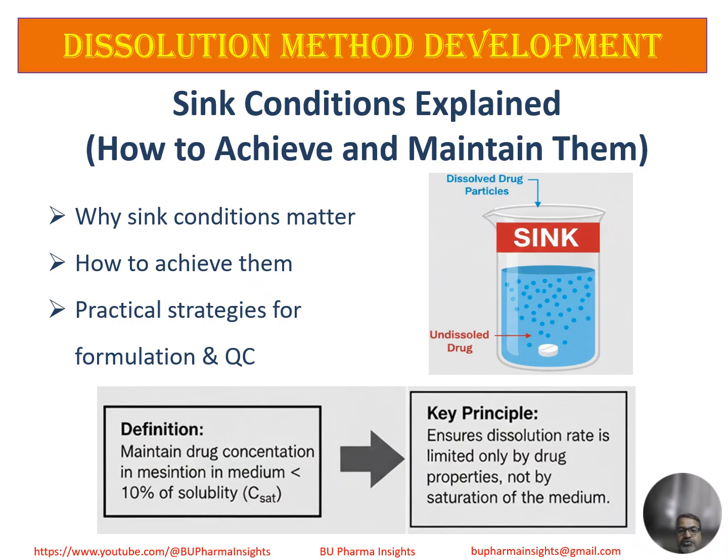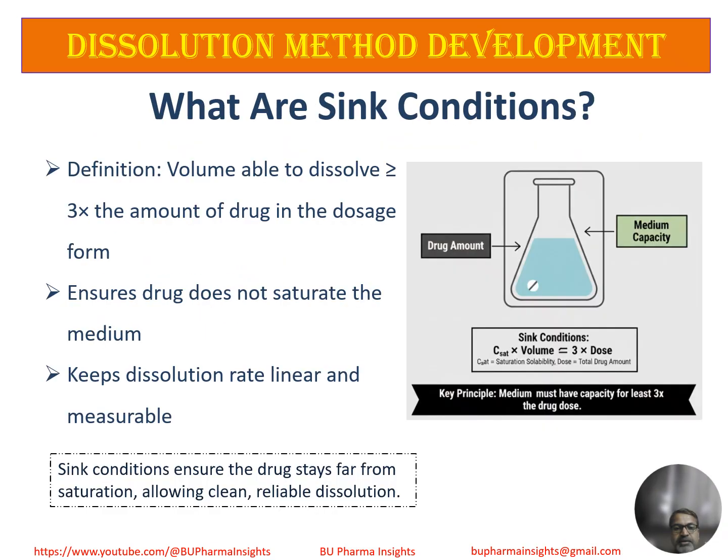Let's break down sink conditions, what they mean, why they matter, and how to consistently maintain them in dissolution testing. In this video, we will cover why sink conditions are critical, how to achieve and verify them, practical strategies for formulation development and QC.